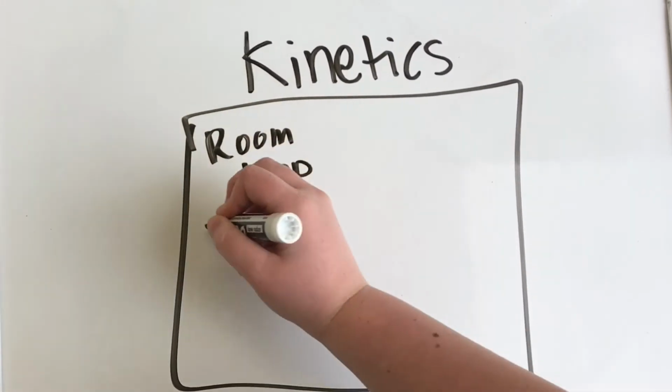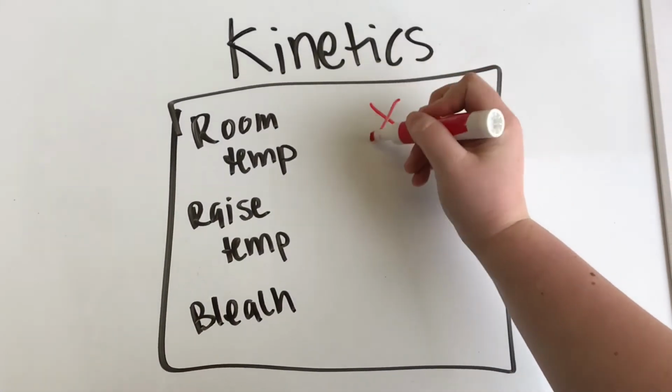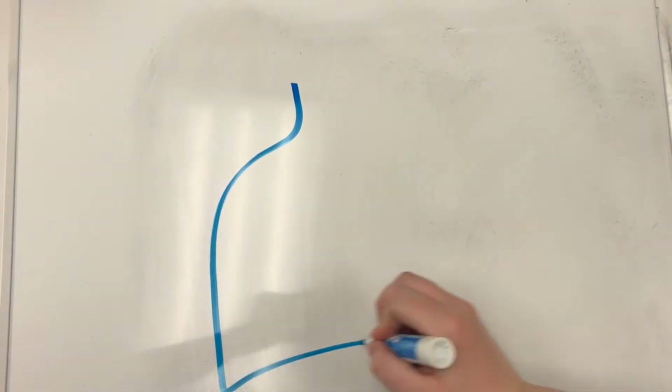In conclusion, kinetics are shown when the temperature is raised with dye and a buffer, as well as in a redox reaction of dye and bleach. This is why if you're wearing a red shirt and get splashed with bleach, the shirt will become spotty.